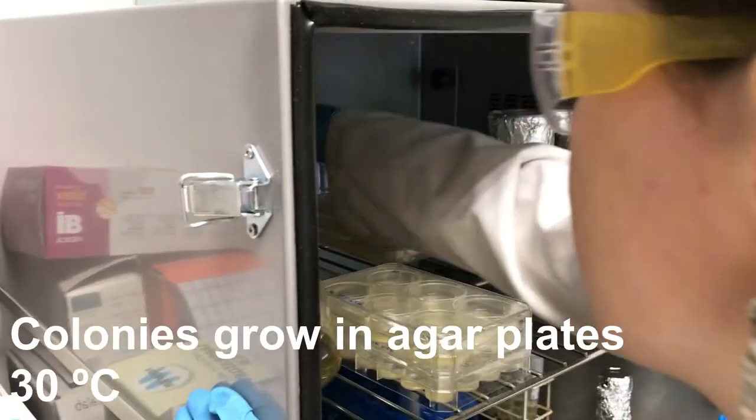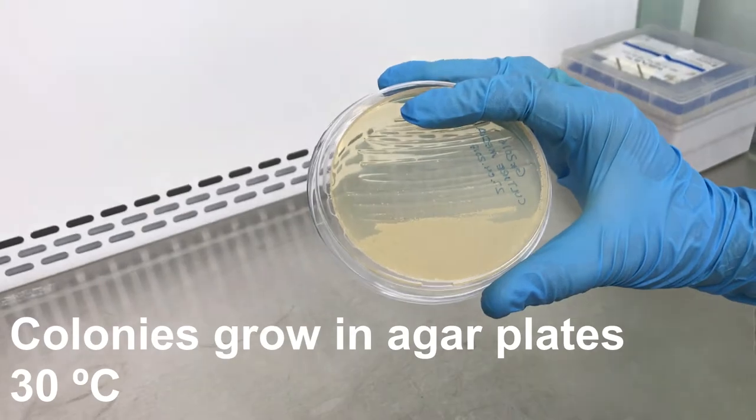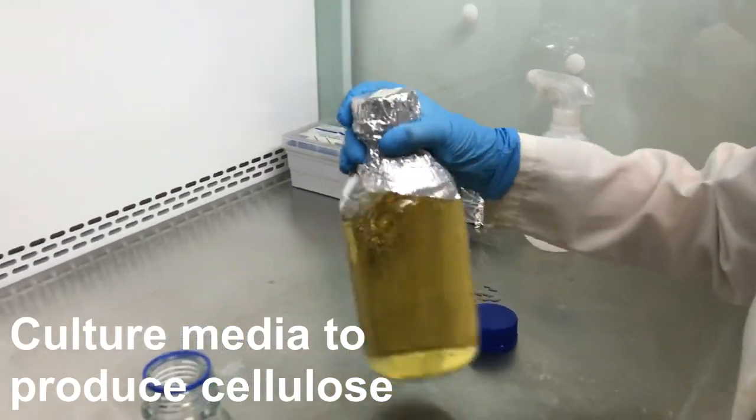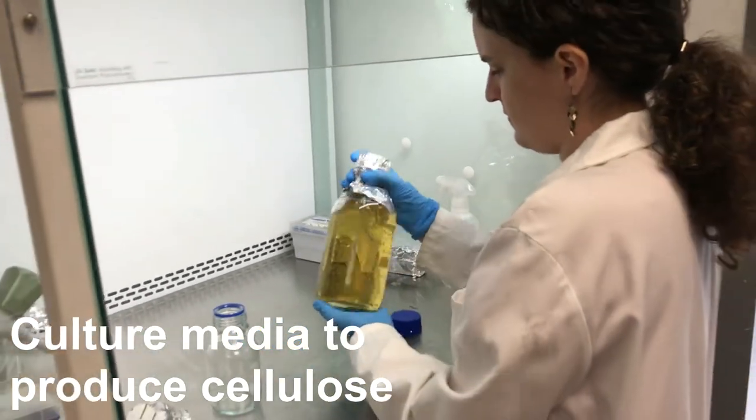We grow the bacteria colonies in agar plates at 30 degrees. That's what they like. And then, cellulose is produced when the bacteria are fed in a culture medium. The reason is still uncertain, but they do it.